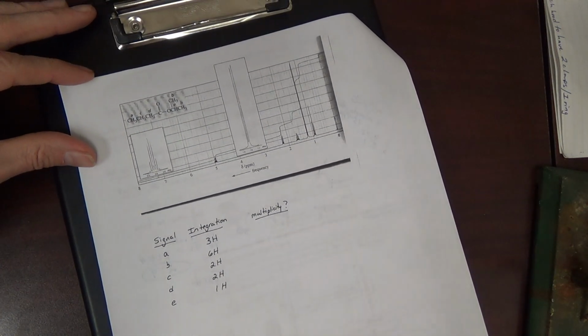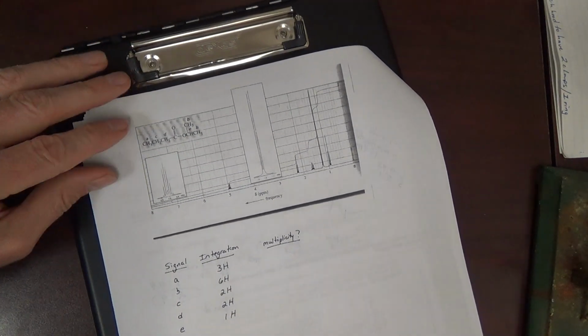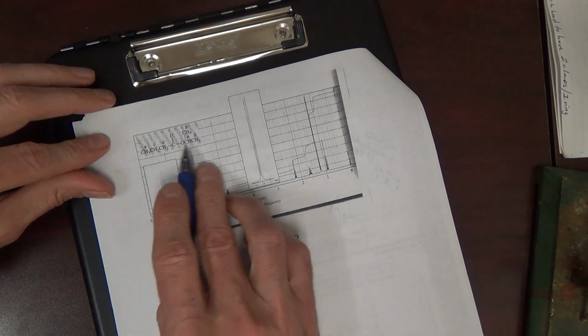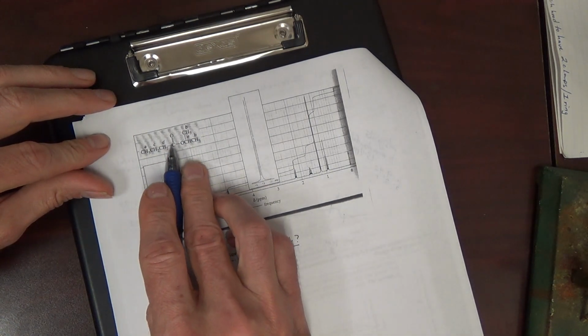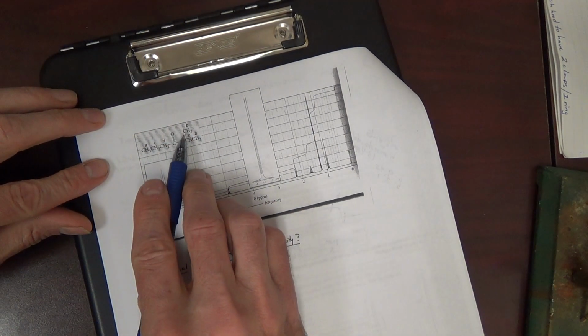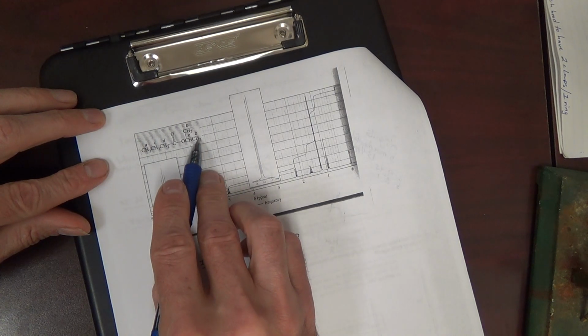Let's look at this compound, and we have a proton NMR. Number of signals, well, that's already given for you. Okay, 1, 2, 3, 4, 5 signals. Hopefully that makes sense. Because of symmetry, these two methyls are the same. Make sure you understand that and realize that.